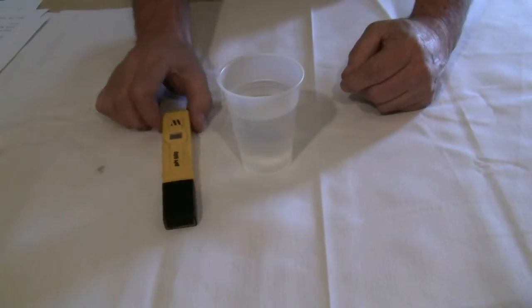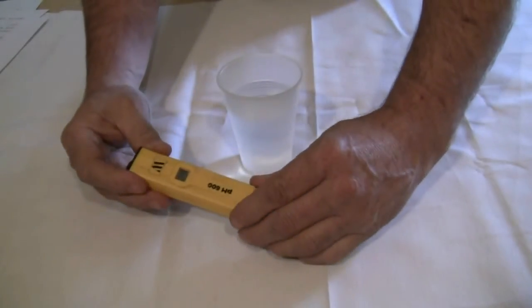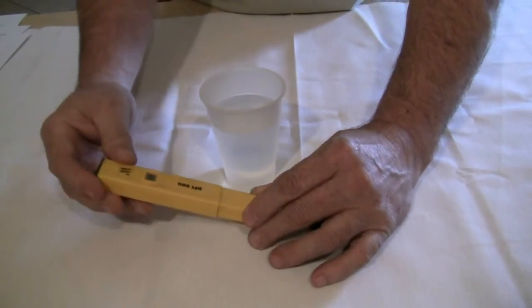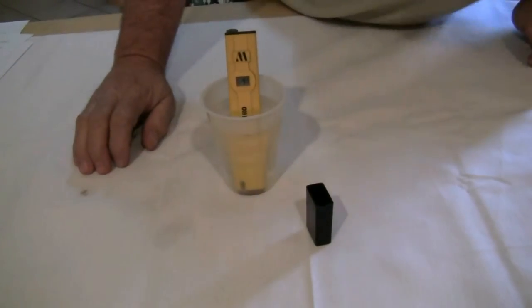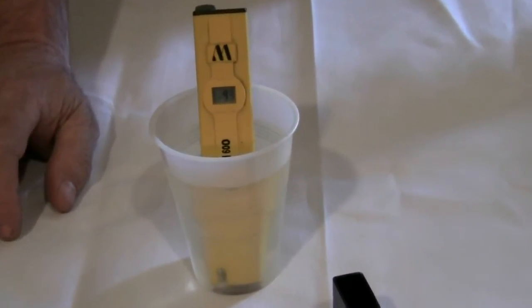To measure the pH, I am using a dip and read electronic tester designed specifically for measuring pH levels. We start by removing the cap, and we turn the unit on. We place it in the water. As you can see, the reading is starting out at 9.2. We leave it in the water and we watch the digital reading.